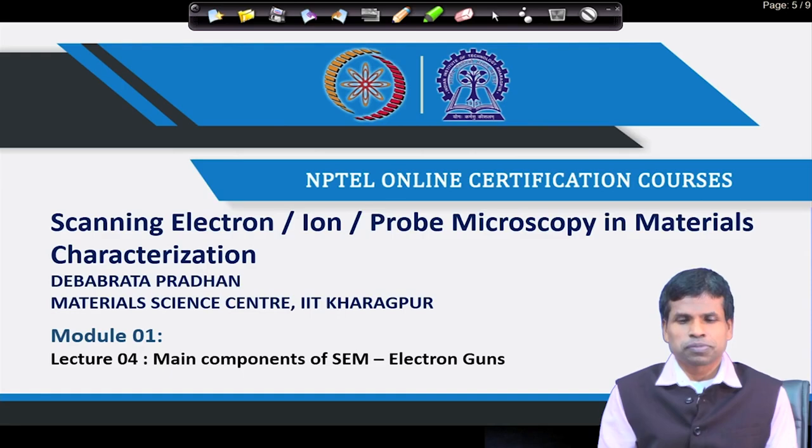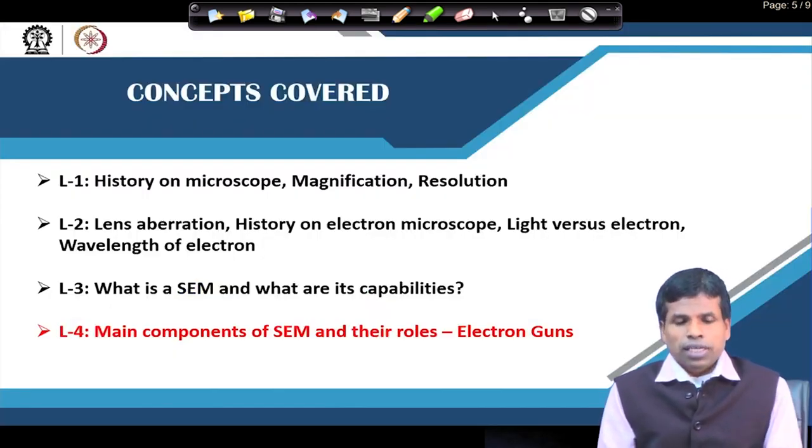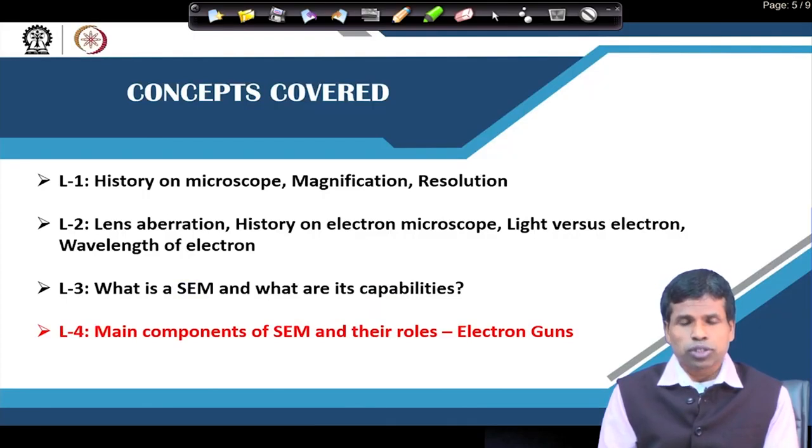Welcome back to this course on scanning electron ion probe microscopy in material characterization. In the last three lectures, we discussed the introduction to microscopy and also what SEM is and its capabilities. Today, we will begin to discuss the different parts of the SEM, scanning electron microscope, and their roles.